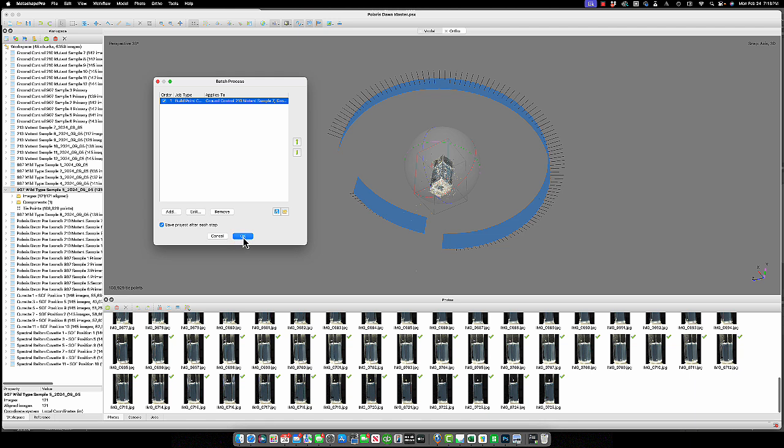So now what we're going to do is press OK, and now we're going to basically make this low density point cloud one that's very dense, and hopefully we'll catch a glimpse of what our model is going to look like because our points will be so closely compacted. The next step after that is to just inspect the root, see how the root looks, combine it if it's been sort of segmented into different regions, and then we might even, depends on whether or not we're actually going to build a model in Agisoft, it's possible we might actually just move it into Blender and draw a line through our point clouds and then build models that way. Again, we just need to understand the trajectory of the root.